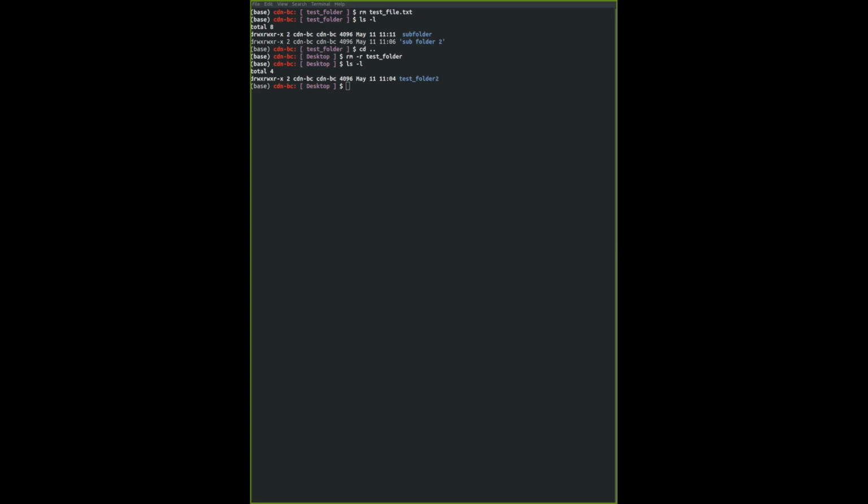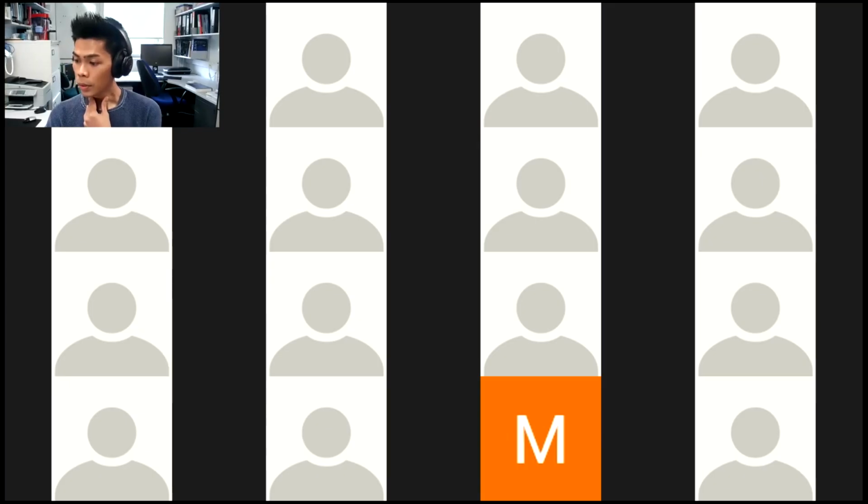So in about 10 minutes, we're going to come back at half past 11, right? Cool. If you haven't tried the activity, the answer is in Etherpad. You can copy that and paste it into your terminal if you haven't done so. If you made it, that's fine. If you have the idea of how to create a directory from terminal, it's a good start.